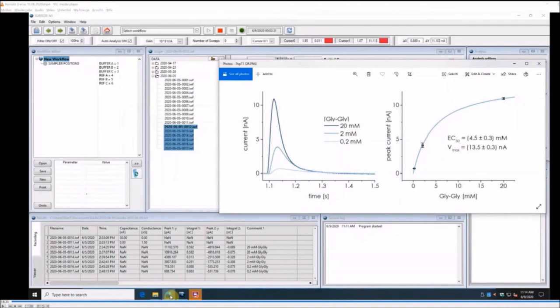And then what kind of cells have you used so far? So as I just mentioned, we used CHO cells and HEK cells as standard expression systems. We also used the cells directly on the sensors and it worked out, but signal to noise was lower. And we also used the cardiomyocytes Maria presented.